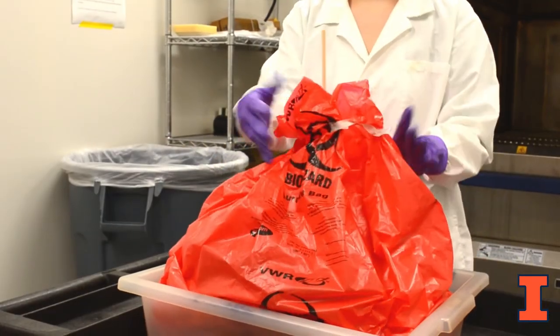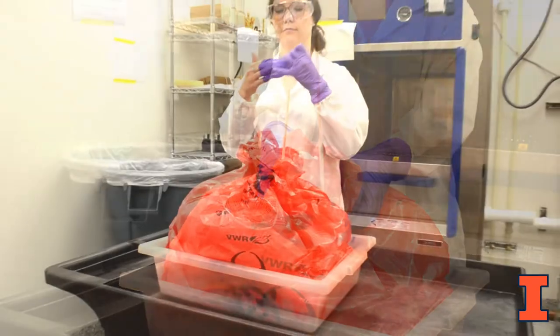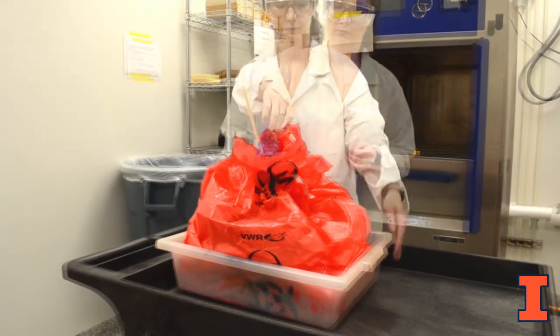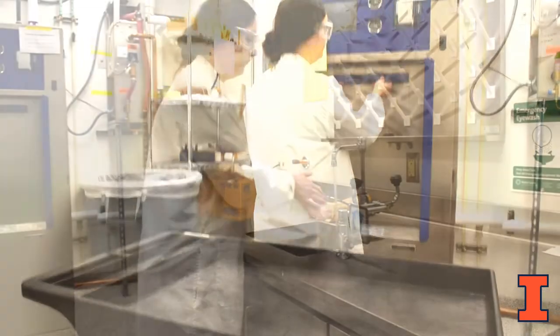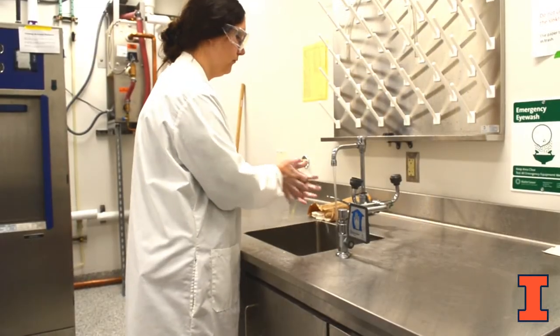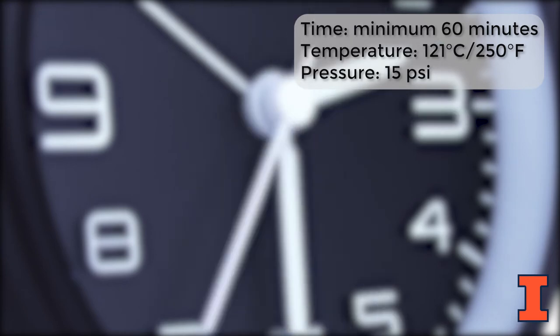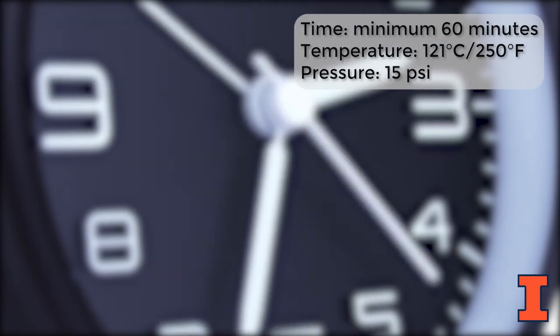Loosely open the biohazard bag leaving at least a two inch opening to allow steam to enter. Remove gloves, place them in the bag, then place the container with the waste in the autoclave. Wash your hands as soon as feasible.